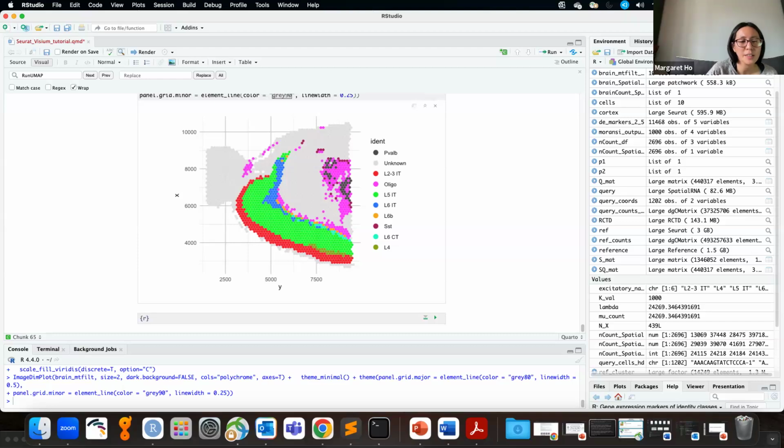You crop the data and redid SCTransform. So if I cropped the tissue data set and then redid SCTransform, generally I would do the cropping at the very end. I would actually run all the analysis on everything, because you don't want to have to run it on each individual component of the data set.